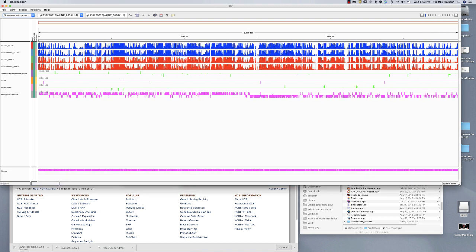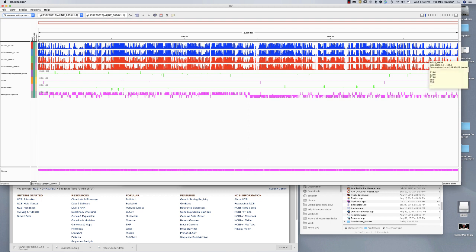If we drag this out you can actually move in — these are the two chromosomes and this shows you where expression is. You can see a bird's-eye view of where expression goes up and down. Right here you can see some genes go down in the surfactant versus up in just the TSB. But doing this visually would really be a pain, so there's another way to do it which I'll show you right now.